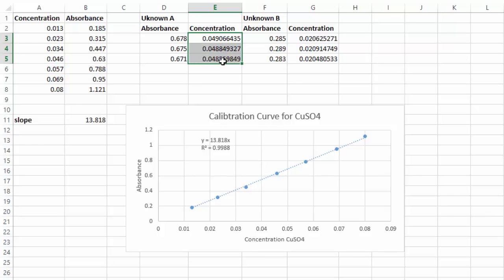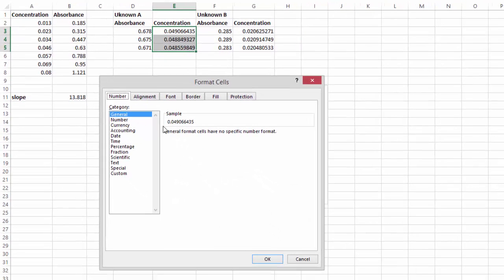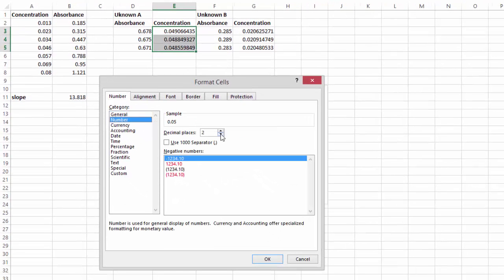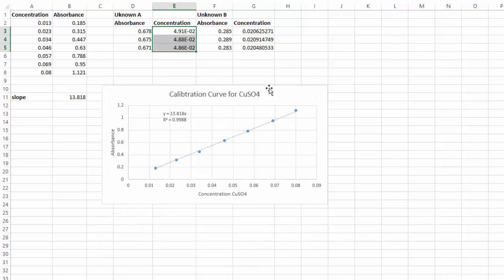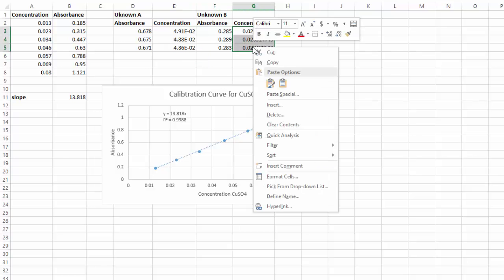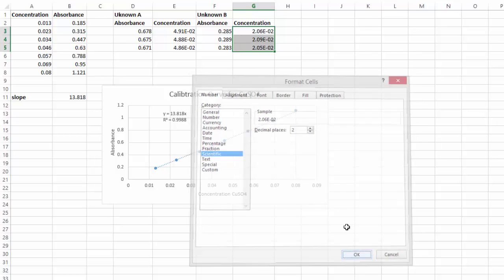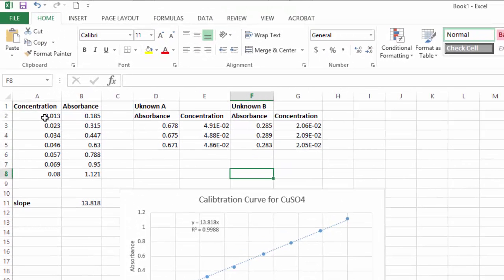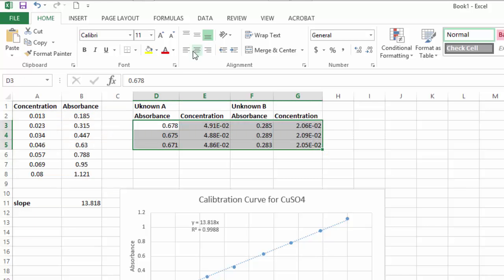I can highlight these cells and, since I should have three sig figs from my absorbances, I'll right-click, go to Format Cells, and change to scientific notation with two decimal places — that gives three sig figs. I can do the same for the other set: highlight, right-click, Format Cells, scientific, two decimal places.